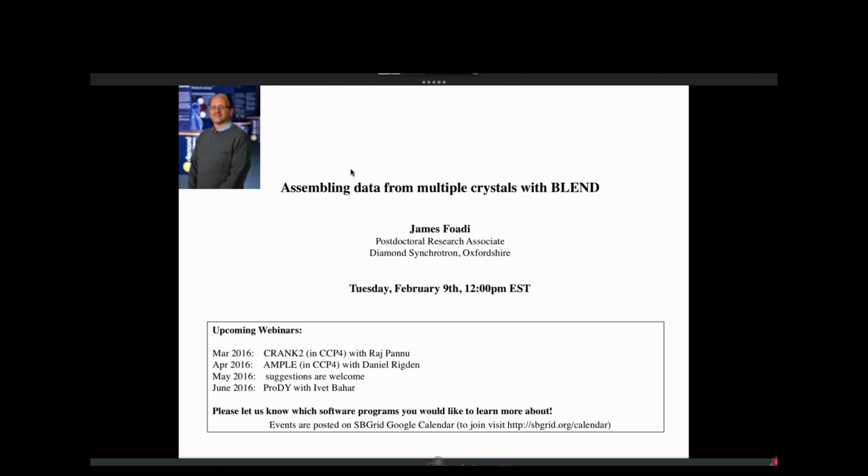What features are you adding to Blend now? What do you think you'll be adding for newer releases of Blend? So the one I'm working on now is this representation of reciprocal space completeness. Obviously, when you have redundancy of data sets and you have to perform a selection among equally valid data sets, the first thing you would like to achieve is completeness, and it's interesting to quickly spot which data set is making the regional reciprocal space completeness more complete. With a diagram where you can easily see which data set covers which region of the reciprocal space, that should be easy to do.